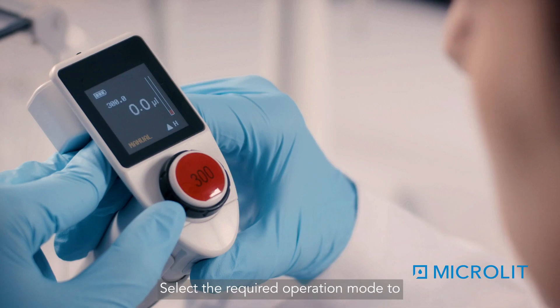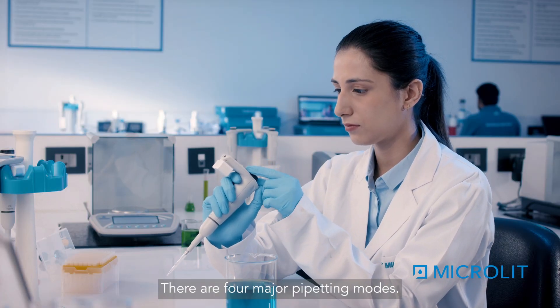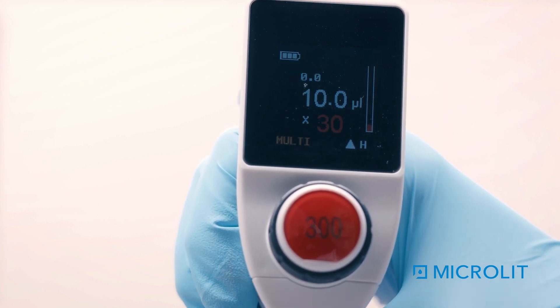Select the required operation mode to perform the experiment. There are four major pipetting modes: Pipette Mode, Manual Mode, Aspirate Mode, and Multi-Mode.